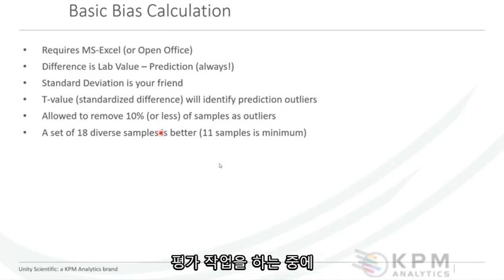But I was working on an evaluation yesterday with one of my colleagues, and there was a sample that was clearly a bad reference value. In this case, we knew it just by looking at one instrument prediction. We could just tell the spectral outliers, it was right in line. The global distance, neighborhood distance were very low.